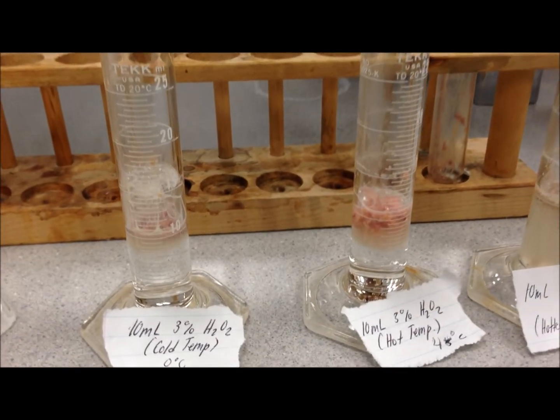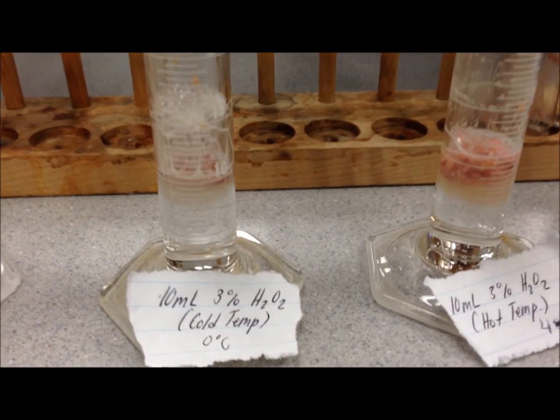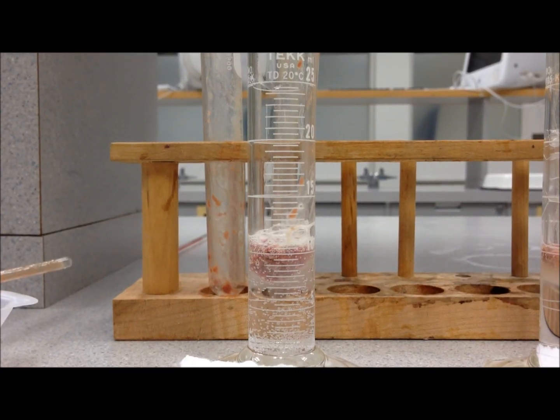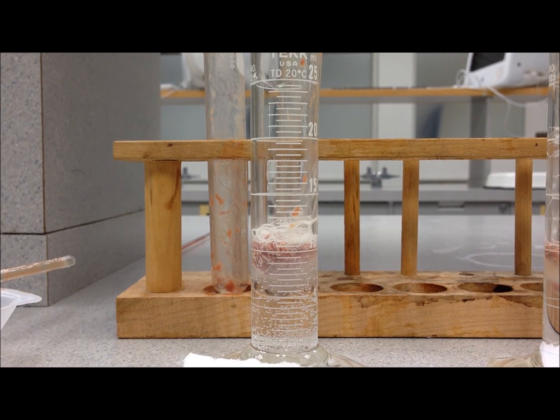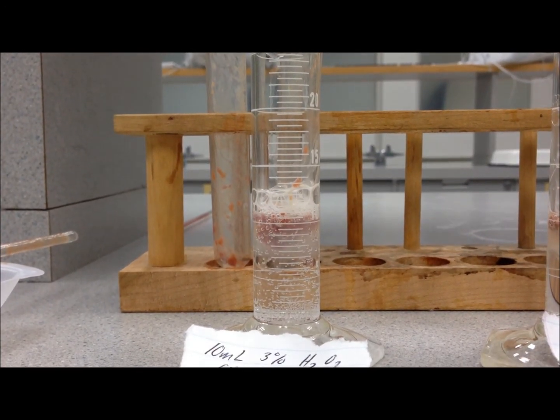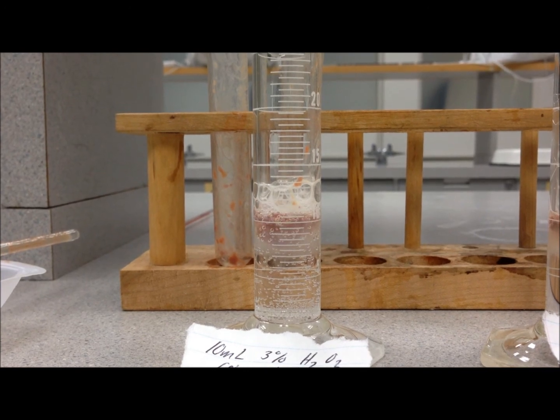For the cold temperature, which was 0 degrees, it produced 13 milliliters of O2, which is weird because we expected the normal one to produce the most, but apparently maybe it's because the reaction was slow, but a higher O2 was produced.